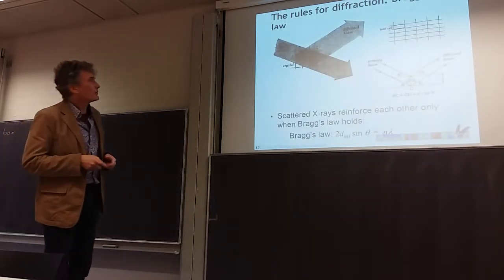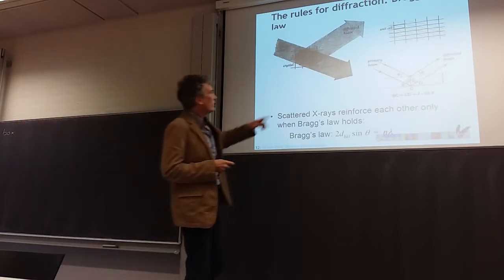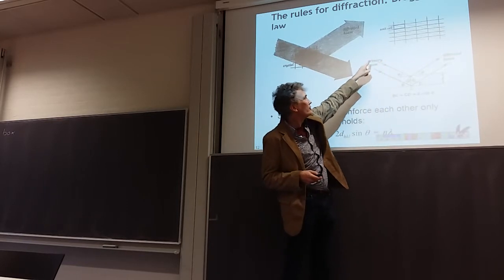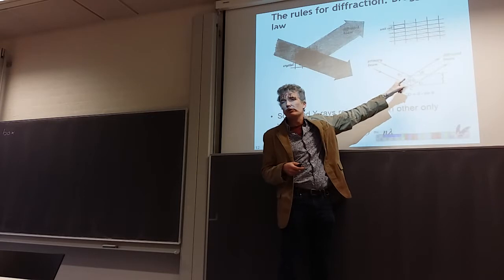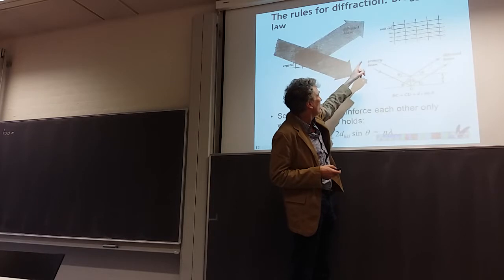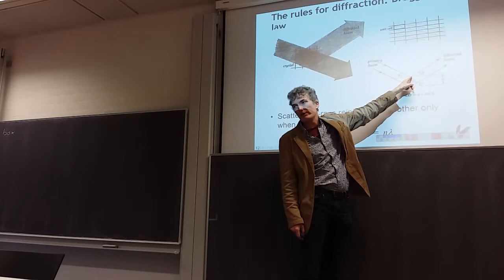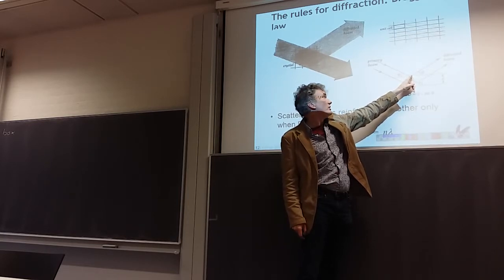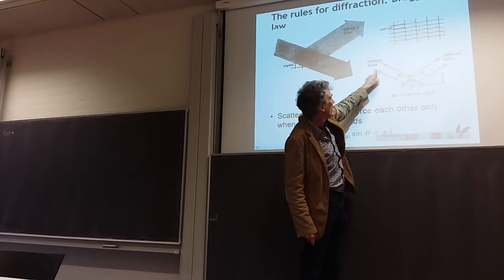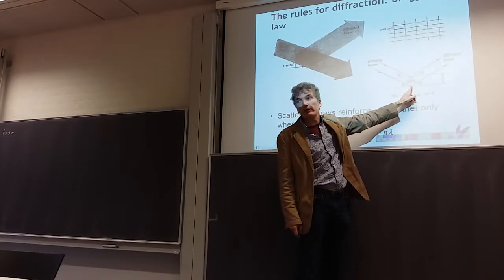This is Bragg's law. So look at the part over here, and you have radiation coming in. It's labeled primary beam here, and it's drawn like straight arrows, but you should imagine that this is a wave, light propagating, and it diffracts on this point, which is probably an atom, or to be more precise, the electron cloud around one of the nuclei, and then another part of the incoming beam is diffracting off another atom.